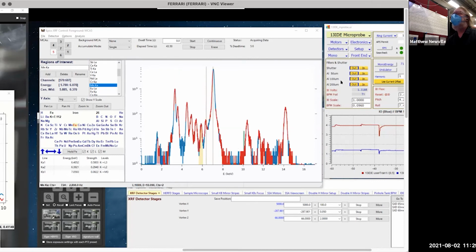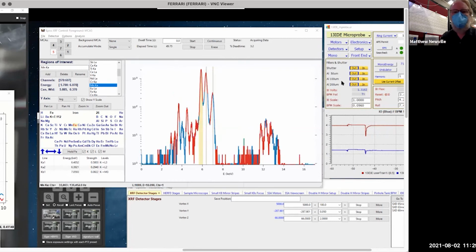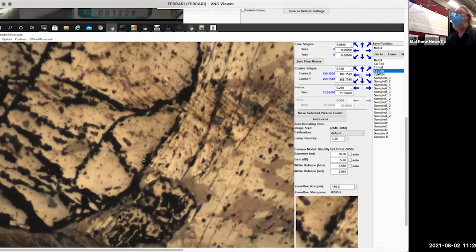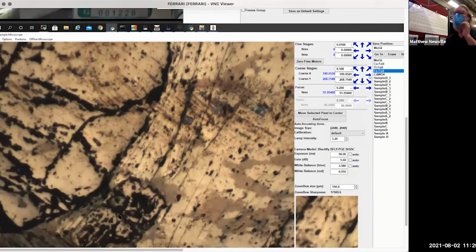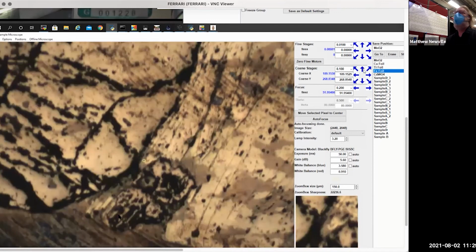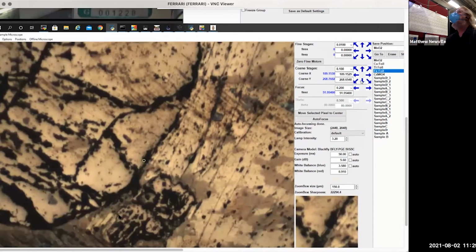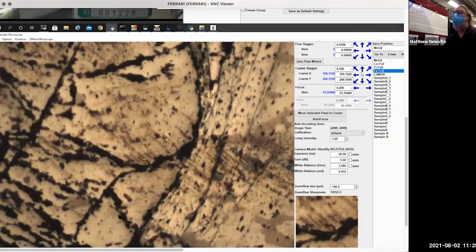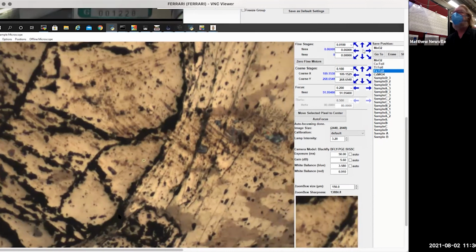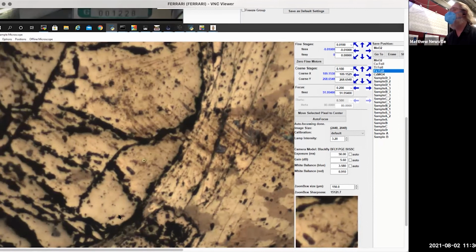Okay, so I'm going to set up then a raster. So let me go back. Okay, so that's doing that. And what I was doing for that was moving the sample around in steps, like 100 micron steps. So there's this thing here. I'm going to go just down here and look at that. Yeah, okay, so good. So what I'm going to do is set up a map. We're going to start at this position, and we're just going to raster the sample back and forth and collect the full fluorescence spectrum.